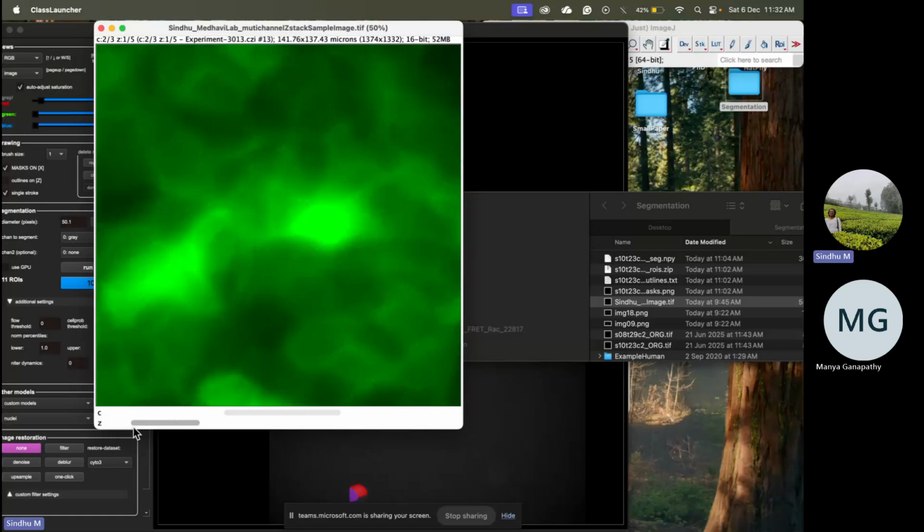Here you can see that the first Z plane is out of focus. The second Z plane has the basal actin stress fibers, and then the top planes have the cortical actin information. Because all the Z stacks have some information, it is better to do an average intensity projection. And the first Z stack is out of focus, so that is not needed.